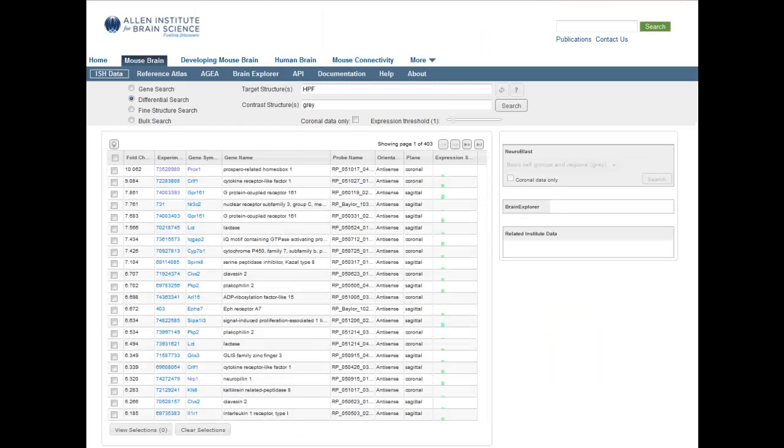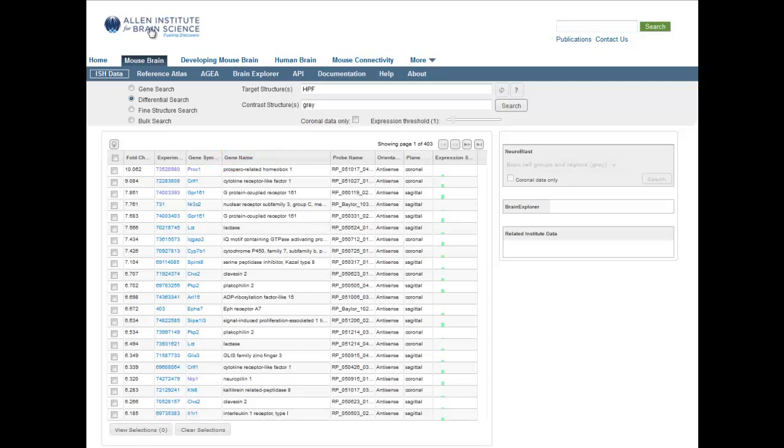Back on the search result page, you'll notice a gene link. Clicking this link will take you to the Experiment Detail page of all the experiments for this particular gene.